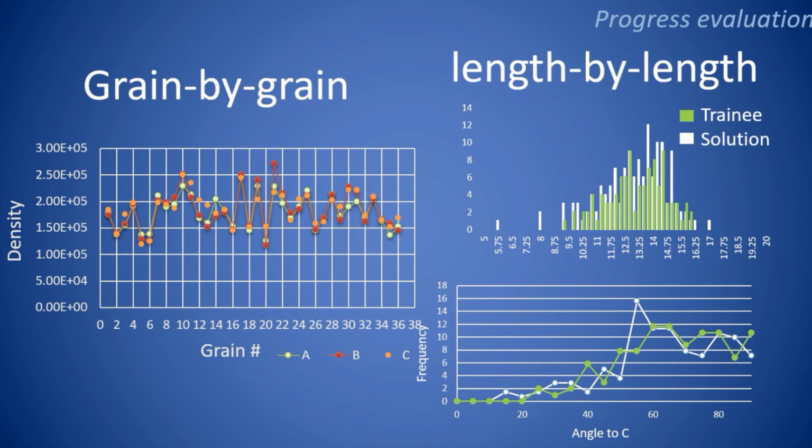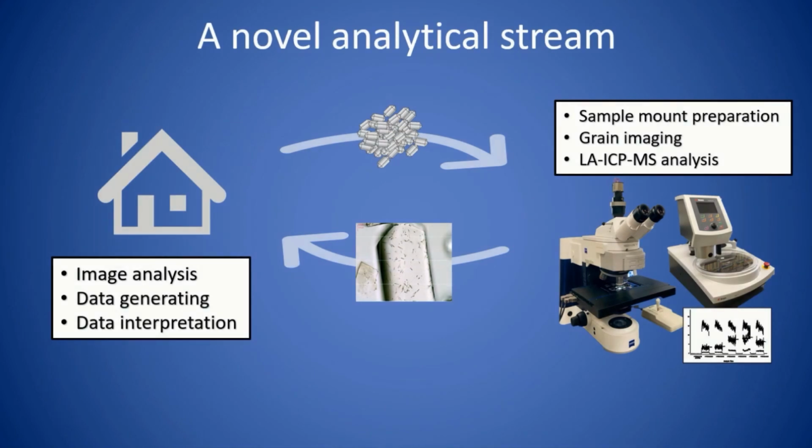length basis. Following this proposed training sprint, researchers have the option to outsource sample preparation, image capture, and the LA-ICP-MS analysis to laboratories equipped with adequate hardware and software. Samples will be returned in electronic form to the newly trained analyst for digital analysis and data interpretation. The advance of this digital training module could potentially make this method more achievable for geoscientists globally currently without either these capacities or access to laboratory overseas.